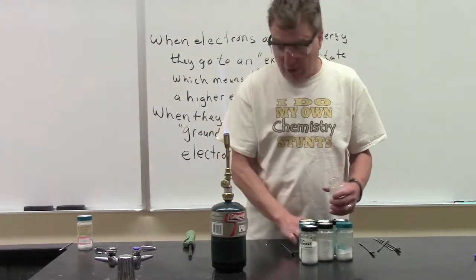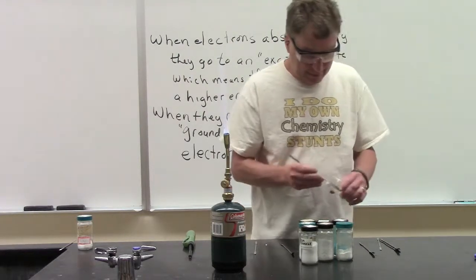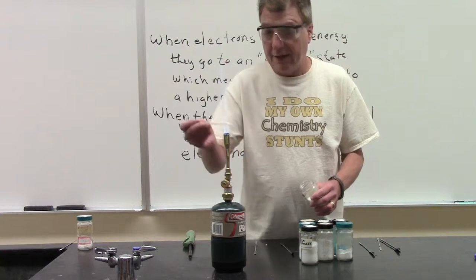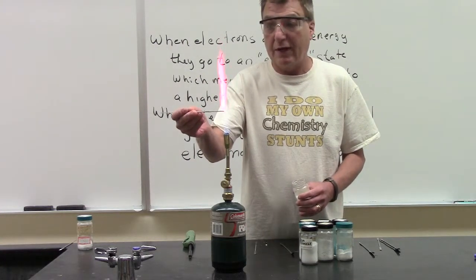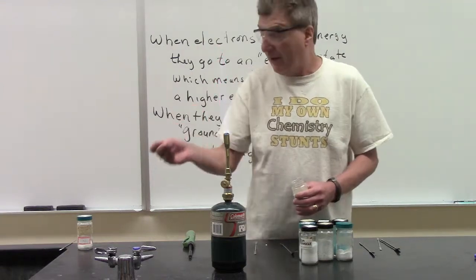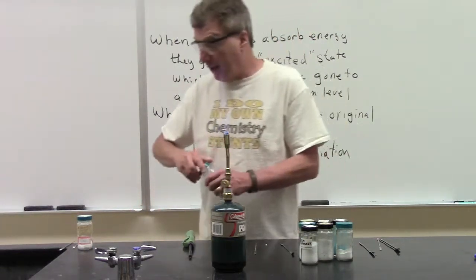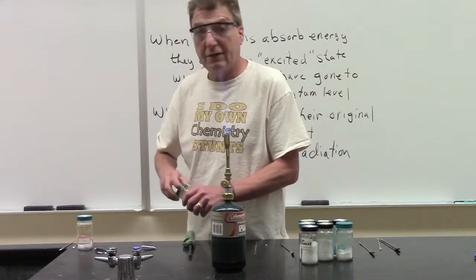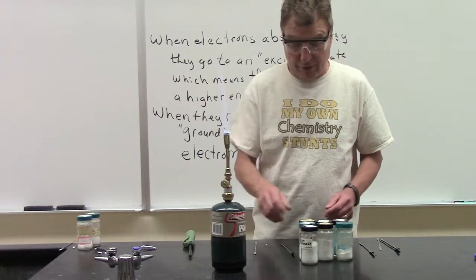We'll go and look at strontium chloride now. We got a green, and now we have a nice red. That's strontium chloride. And these flame tests are often used in the field to quickly determine if chemists or scientists can determine what elements are present.